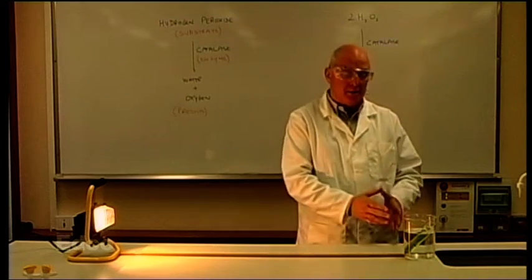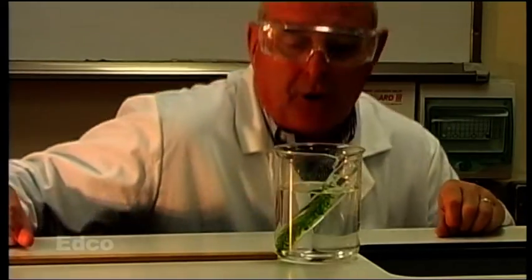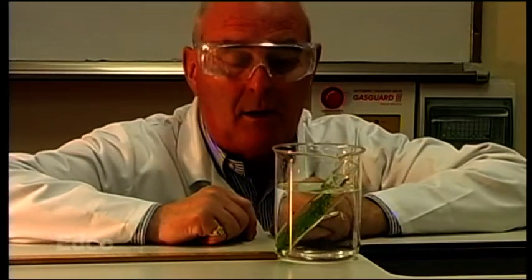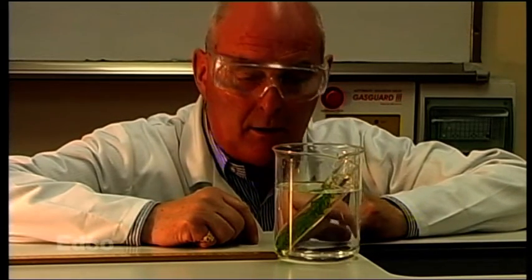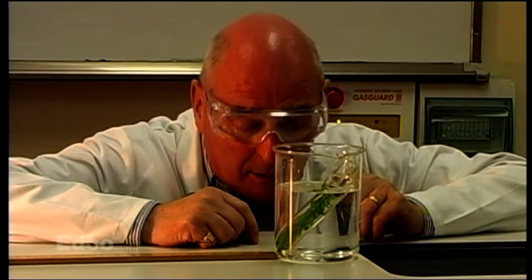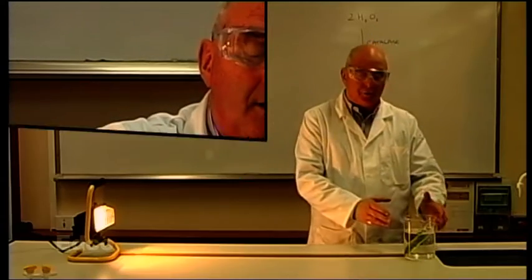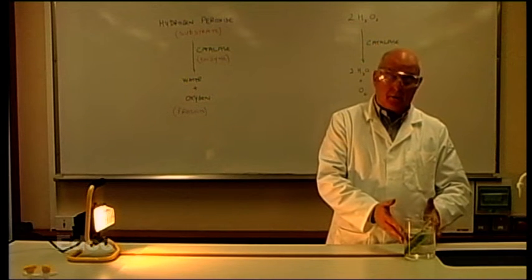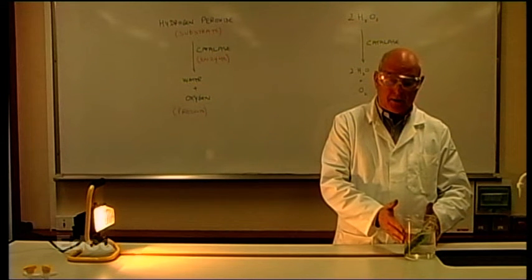So after 2 minutes, bubbles are forming. And what we do is we count the number of bubbles produced per minute. And we do that 3 times and get the average. The results at 100 centimeters were that the average number of bubbles per minute was 6 bubbles.